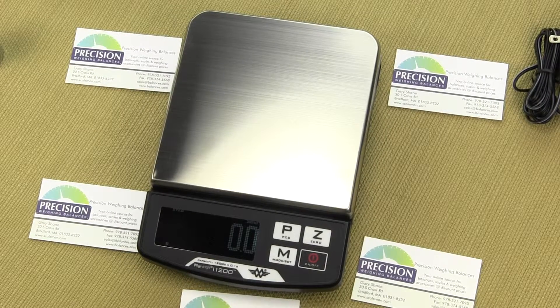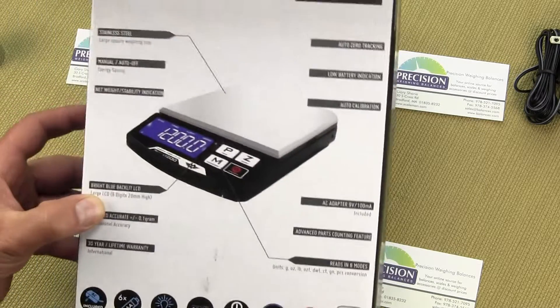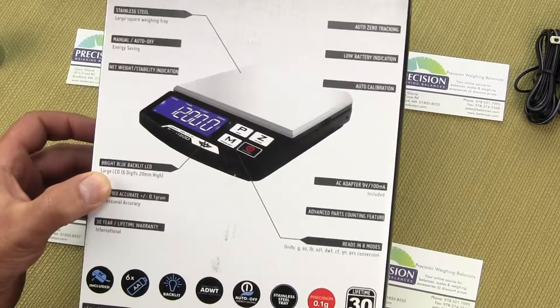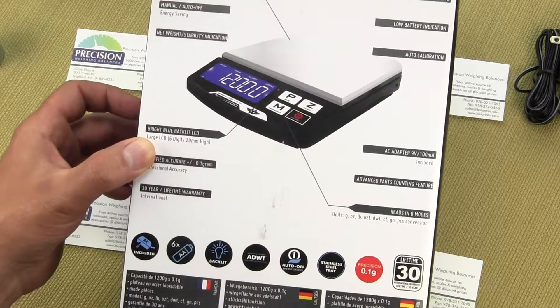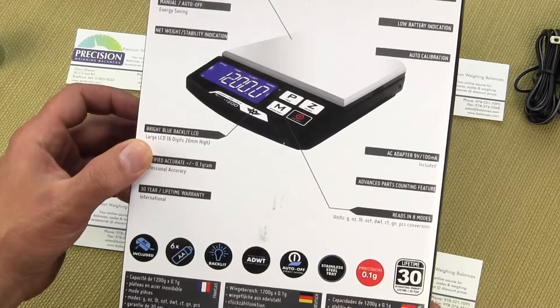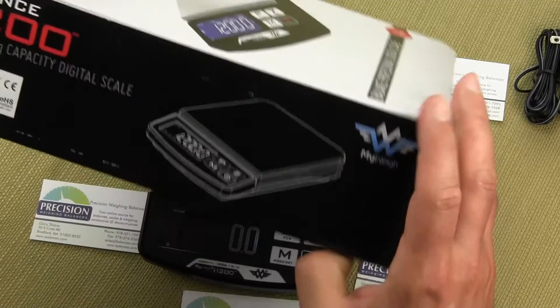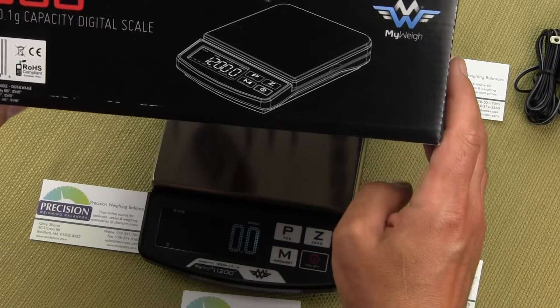In this video we'll be demonstrating the MyWay i1200 version 2. The version 2 is MyWay's newest series. It now comes in a new box and also has an LED display. The prior version had an LCD display, and you can see MyWay delivers their product in a very colorful box.